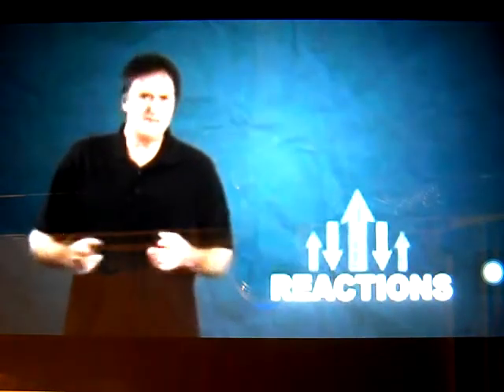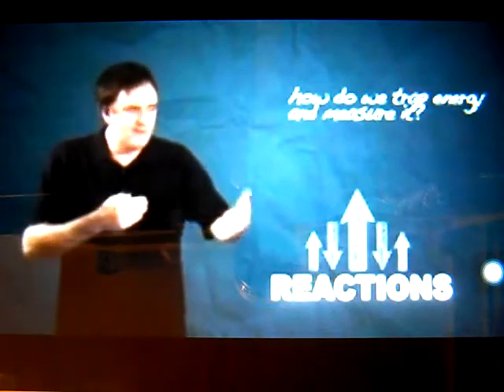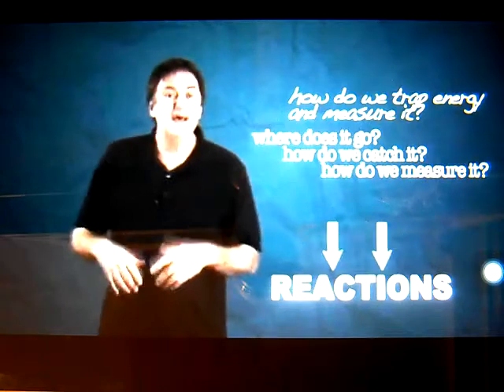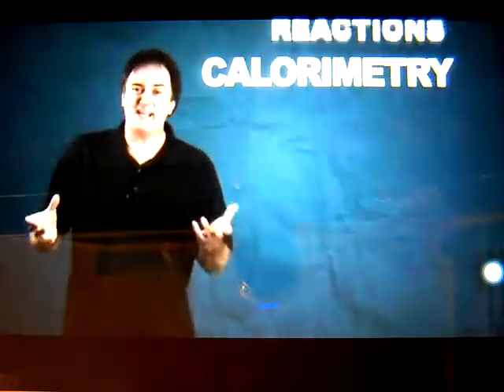In thermodynamics, we're constantly trying to measure these quantities of energy that go in or out of reactions. The question should come up, how do you trap energy and measure it? I mean, moving out of a reaction, where does it go? How do you catch it and how do you measure it? Calorimetry is the answer to this. It's actually a pretty clever technique.